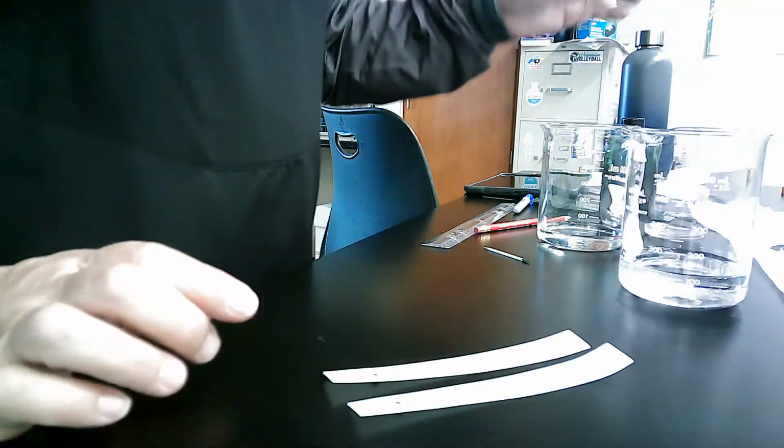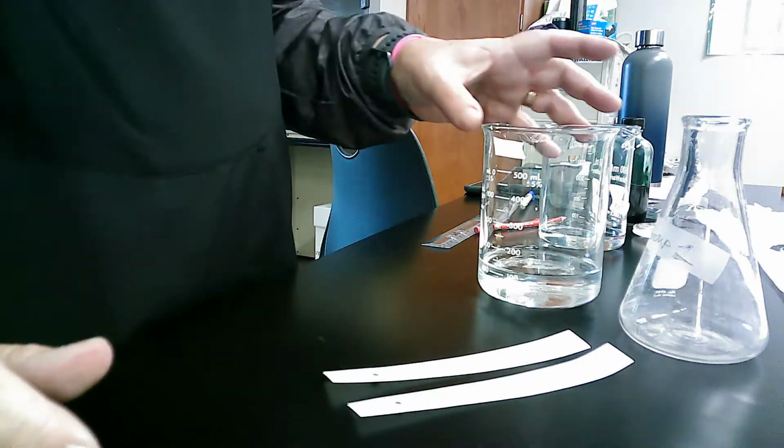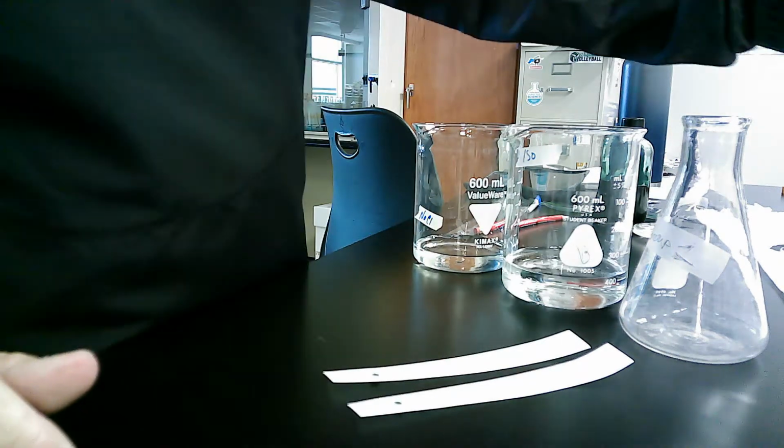And while that is drying, I would get my solvents ready. I can either do this in a flask or in a beaker. I'm going to do it in a beaker. It's a little bit easier to see. So I would have my two solvents. This is the isopropyl alcohol. This is the sodium chloride. The directions say to get about 20 milliliters.